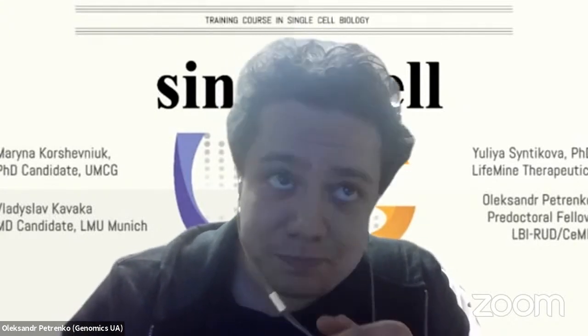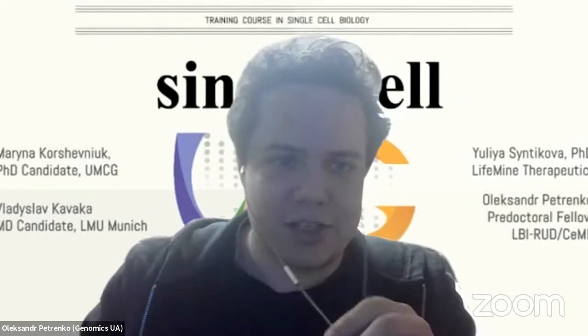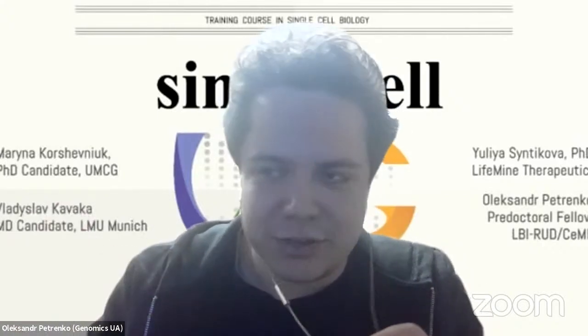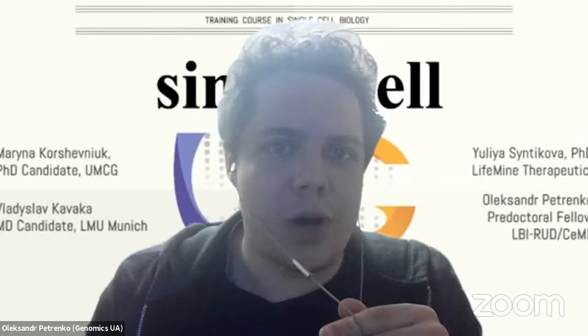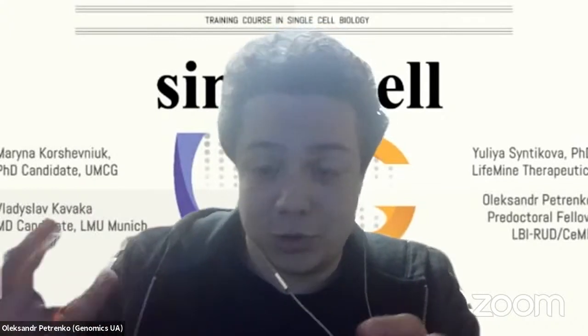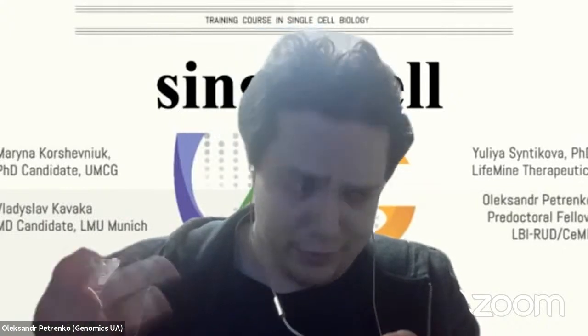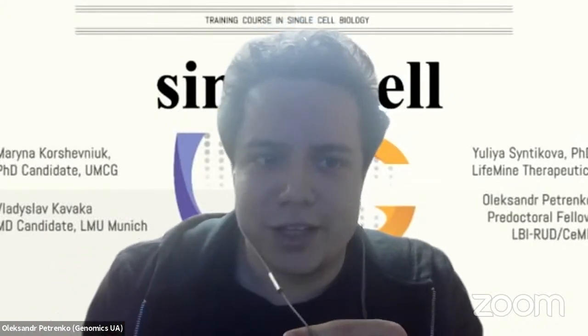So the first question, 10x microfluidics. It means that there are small microfluidic vessels, small gems or these bubbles. May it happen that two cells instead of one cell will be trapped in one bubble and marked with unique molecular identifiers? And if yes, what can we do with that?